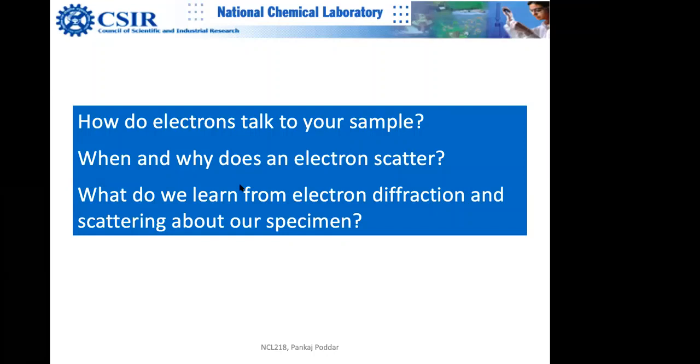So that electron-nucleus interaction was borrowed from Rutherford scattering, because Rutherford used the alpha particles, right, where you have two positive charges. So basically, the electron microscope people didn't want to do a lot of effort. They just stole two equations. I always say that one part of the equation was stolen from the X-ray people and another part was taken from the Rutherford equation. And then combine and boom, you have the equation for your elastic scattering.